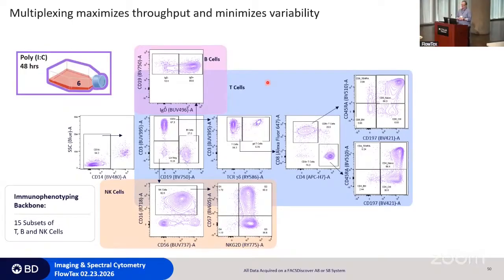I really didn't want to include markers that are traditionally used for phenotyping like HLA-DR because it's so impacted by activation. So I was going to have massive changes in activation. I wanted to have a gating strategy that was basically untouched by activation so that I could compare specific populations, right? So my gating strategy only used markers that remained unchanged before and after activation.